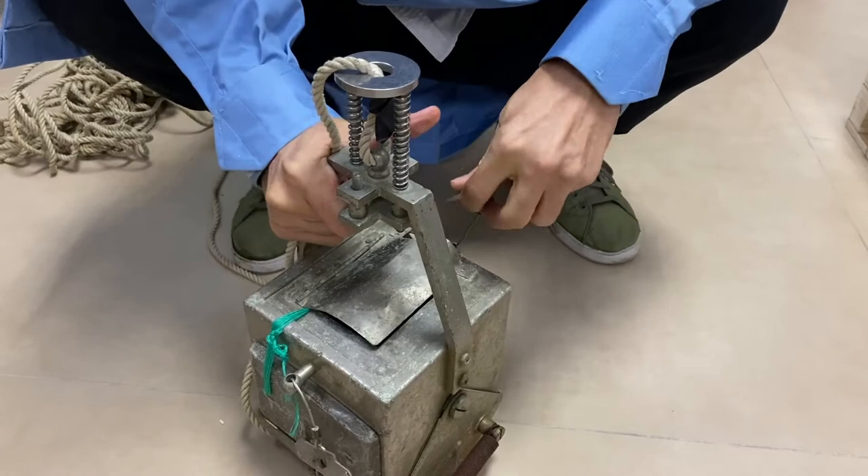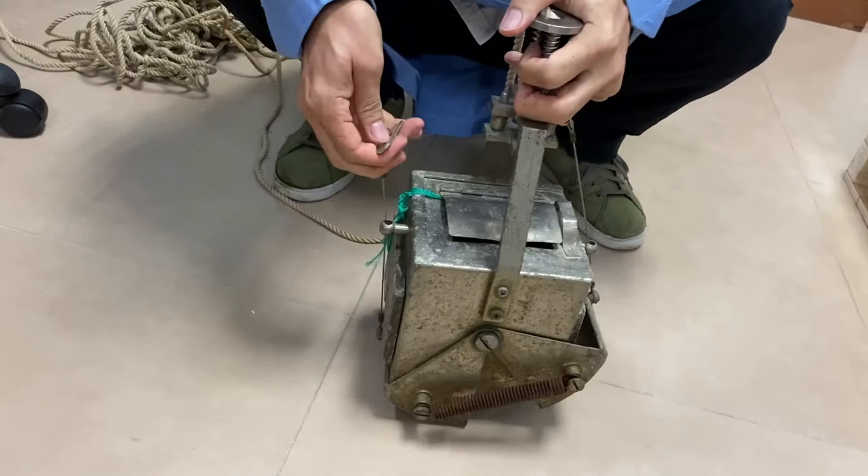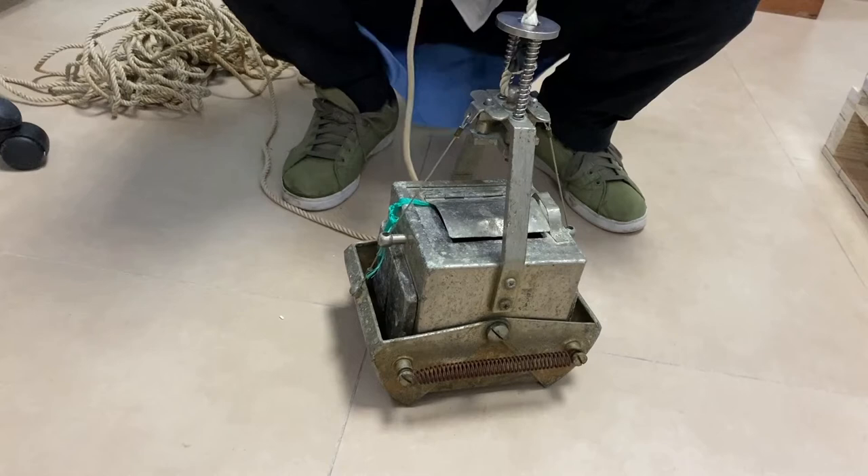The whole structure is heavy. It has to be heavy because it is by gravity that it sinks into the sediment, and if it's heavy enough, you'll be able to enter deep enough into the sediment to obtain a suitable sample size.